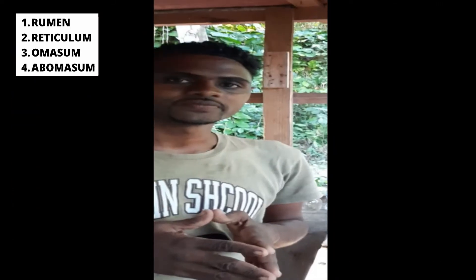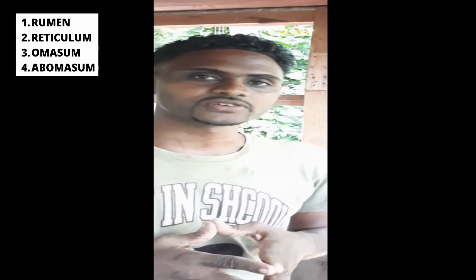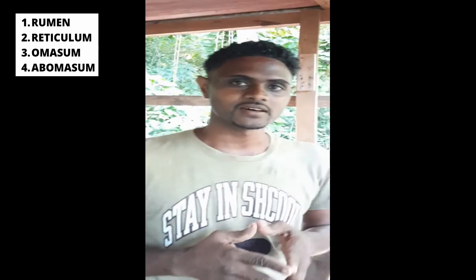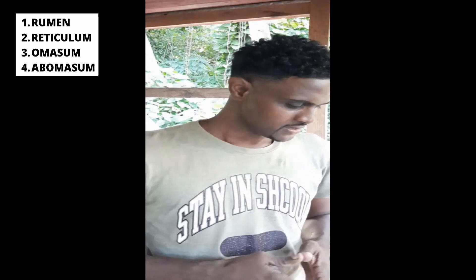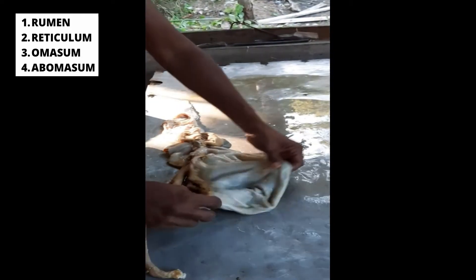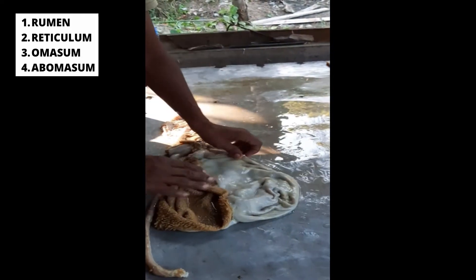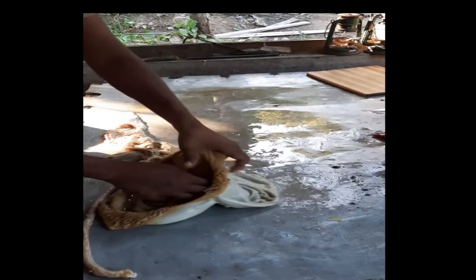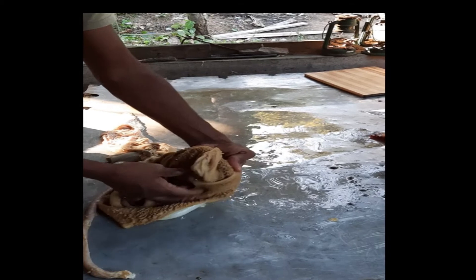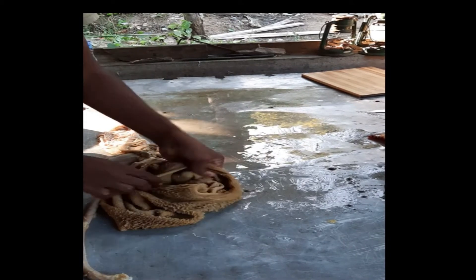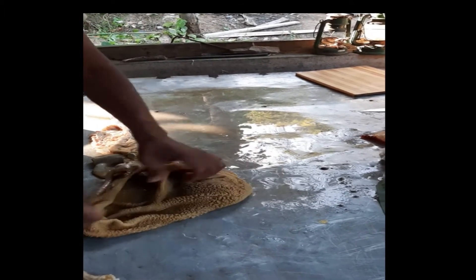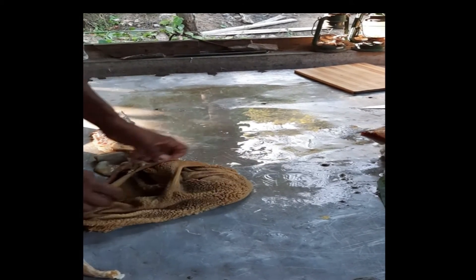Alright guys, I opened up the stomach of the goat, which is a rumen and stomach. I'm going to show you inside of each compartment. So this is the rumen, which we said is the largest part, and this is the inside of the rumen.